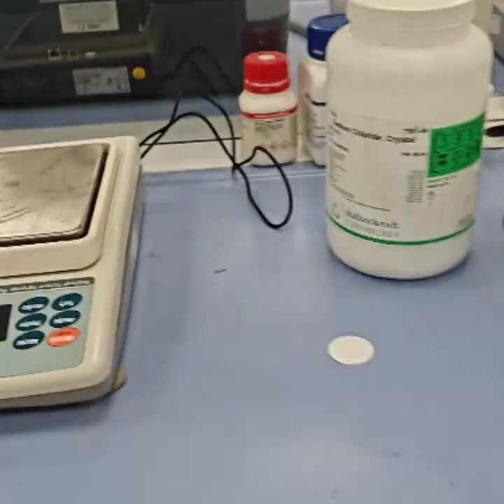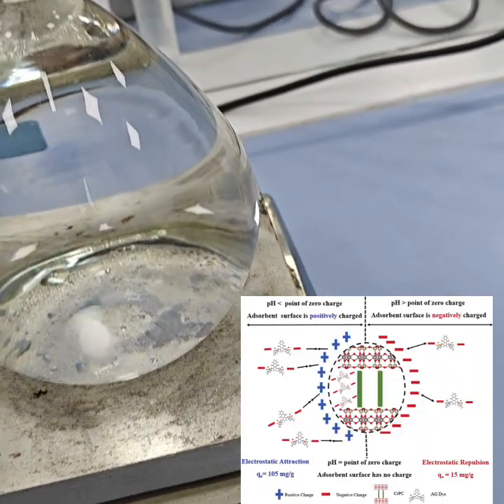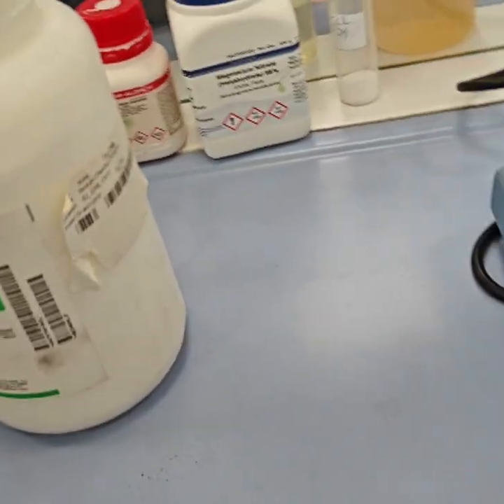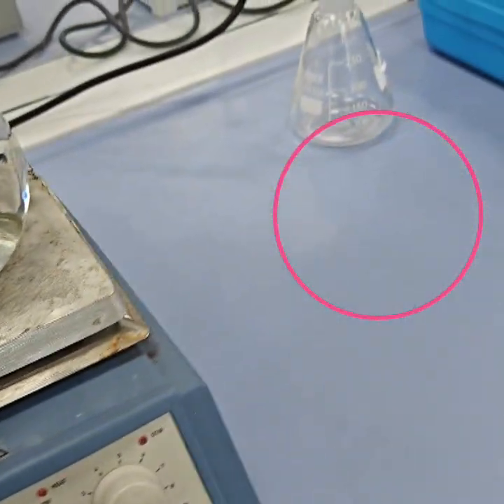Hello viewers, in today's video we will find the point of zero charge. As you saw a few minutes ago, I was talking about point of zero charge and zeta potential. So now we all know what the point of zero charge and zeta potential are, and why they are significant for adsorption studies.